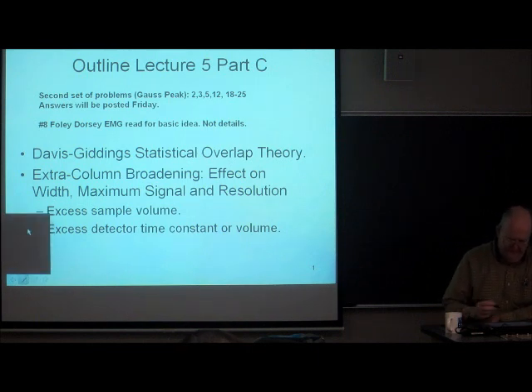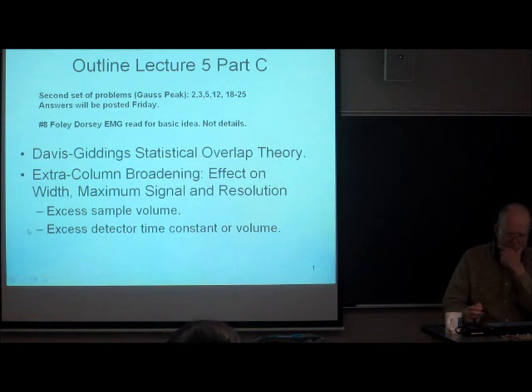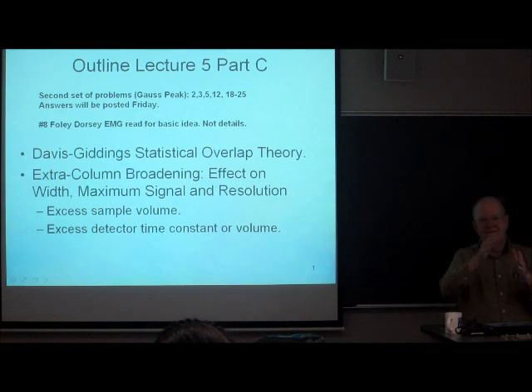So this approach, I gave you the reference the other day. We started in a 1985 paper by Cal Giddings and Joe Davis. There must be at least 50 papers that follow on from there, elaborating the ideas in greater and greater detail, going from simple one-dimensional separations, which is what we're talking about now, into multi-dimensional separations.